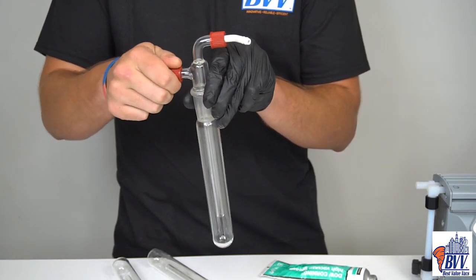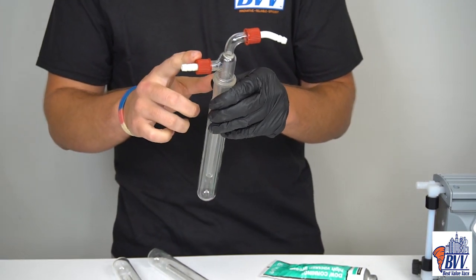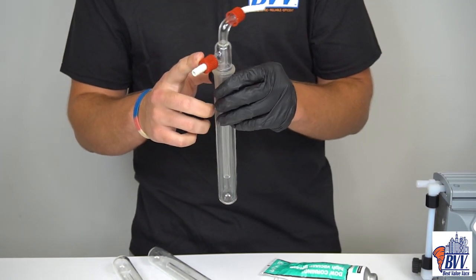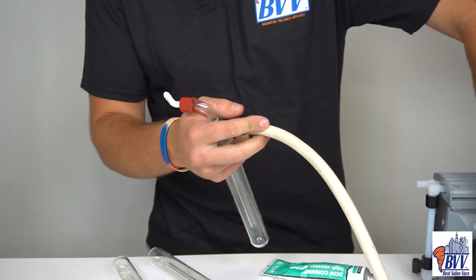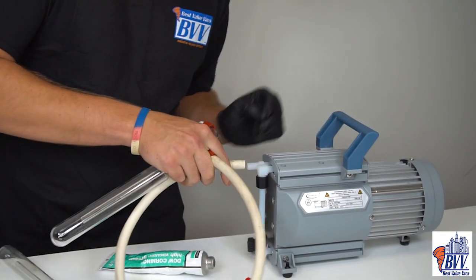So this is my third and final one. I'm going to make this one go straight to the vacuum, so that's why I'm using a straight barb here. So your vacuum pump, you can hook it straight up to the cold trap.